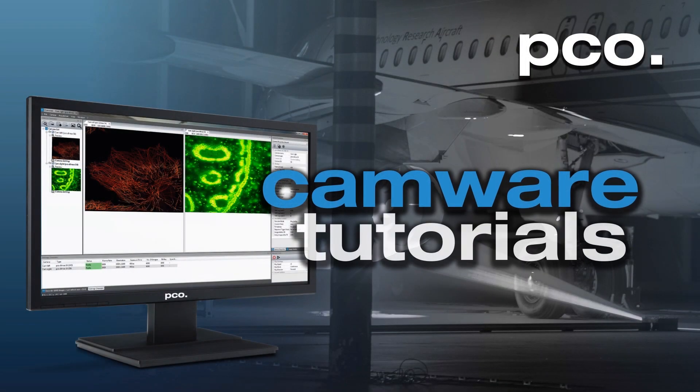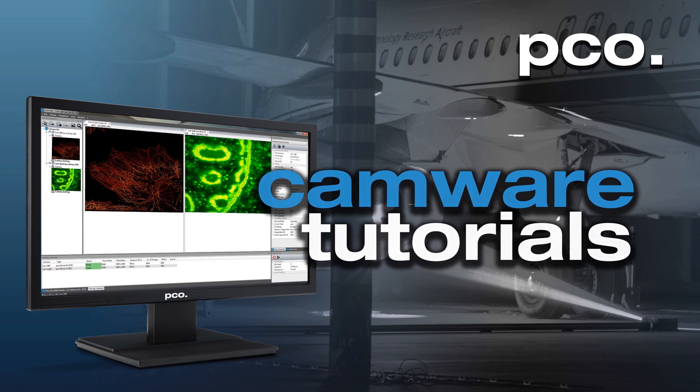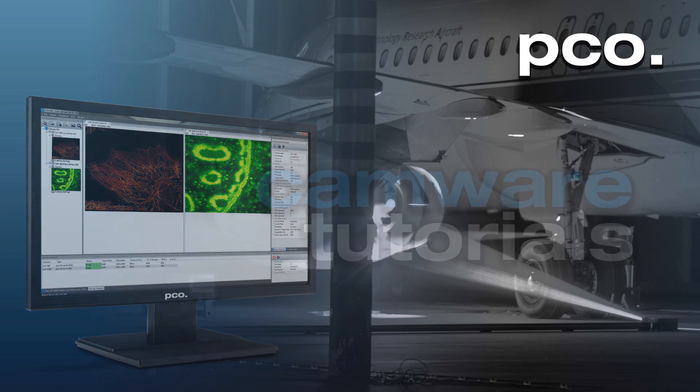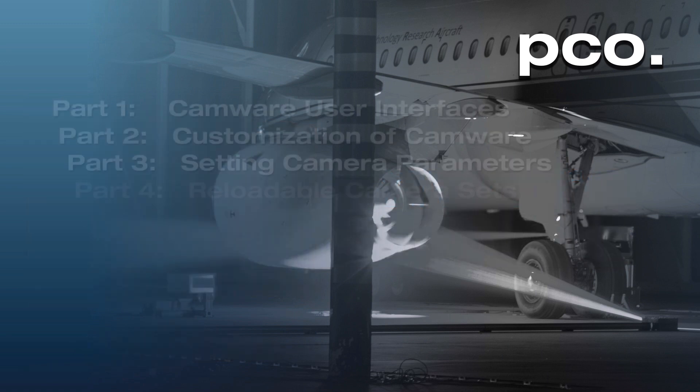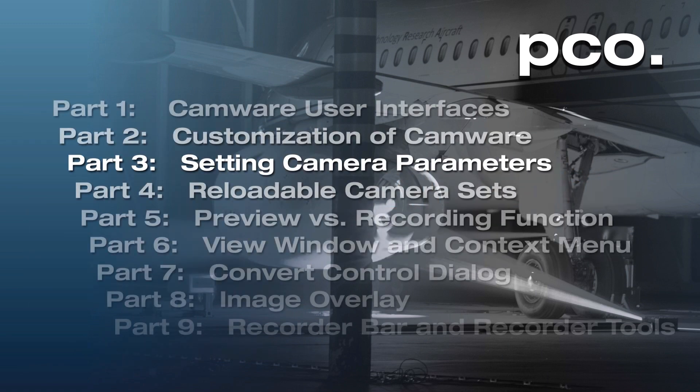Hello and welcome to the PCO CamWare video tutorials. Today's video tutorial will guide you on how to set your camera parameters.